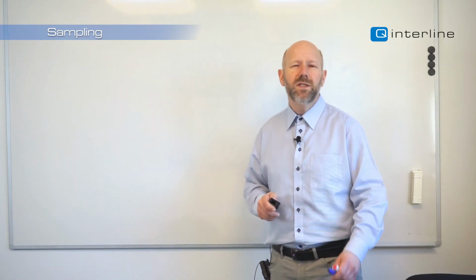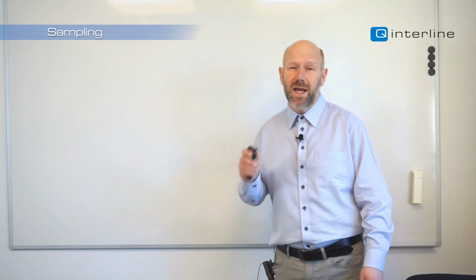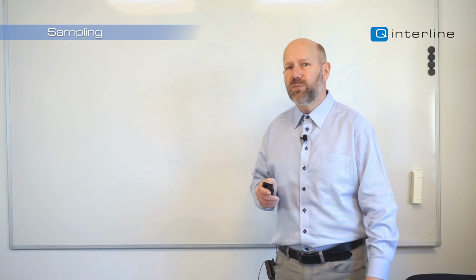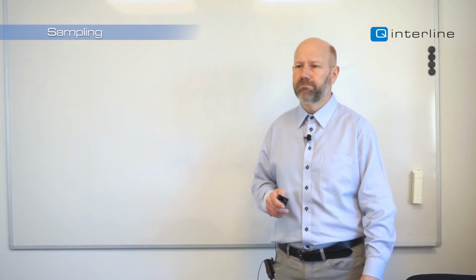In this video, I will talk about how we present sample to the analyzer, because what does the analyzer actually see? In the video, I will have slightly more focus on at-line analysis, but the question, what did the probe or cell actually see, is equally important for online.